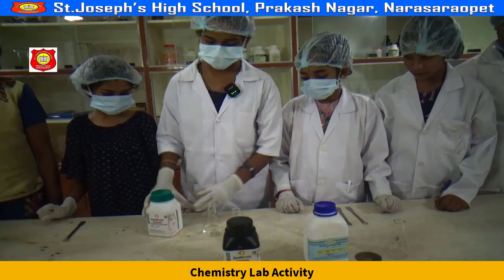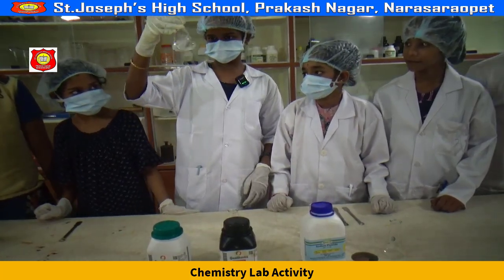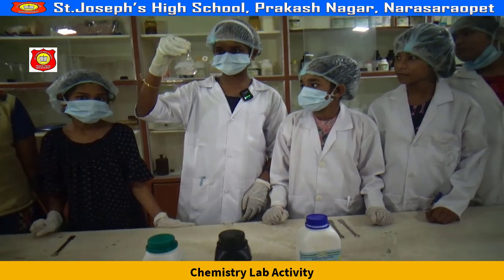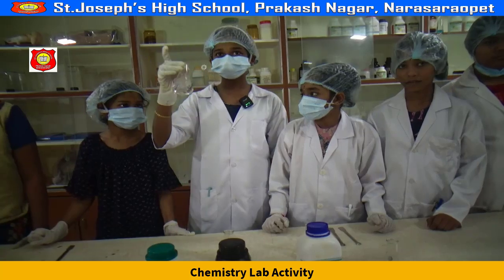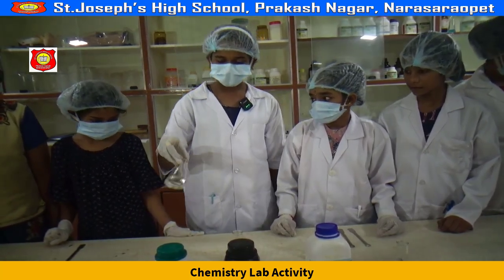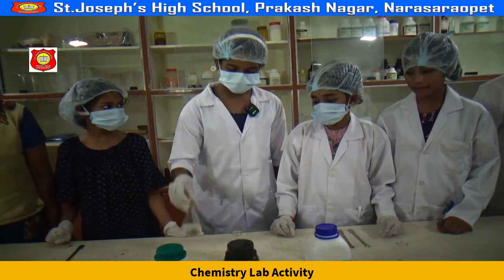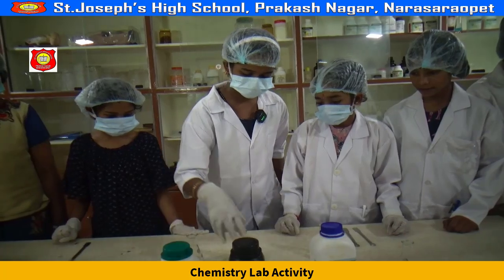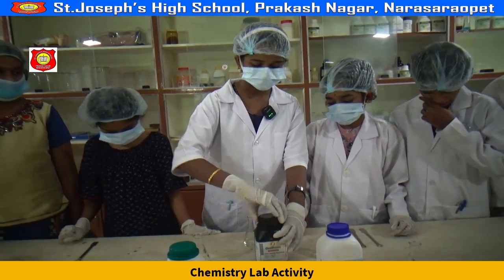Now we are going to stir it. And the molecular mass of potassium thiocyanate is 97.18, and the formula of it is KSCN. Now I am going to add ferric chloride.